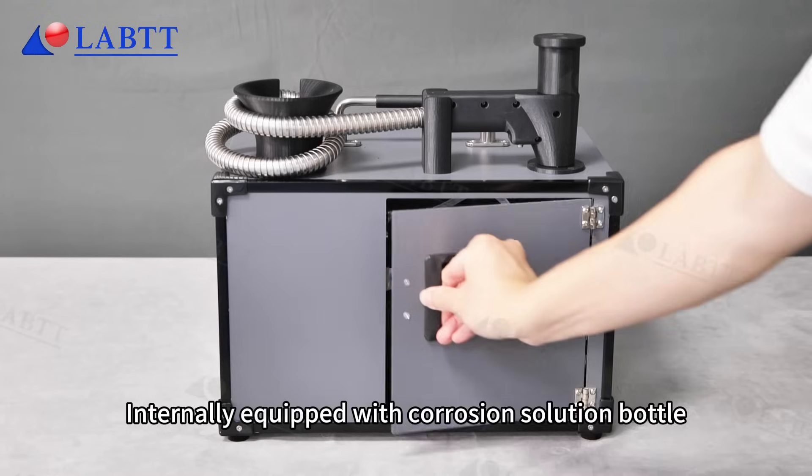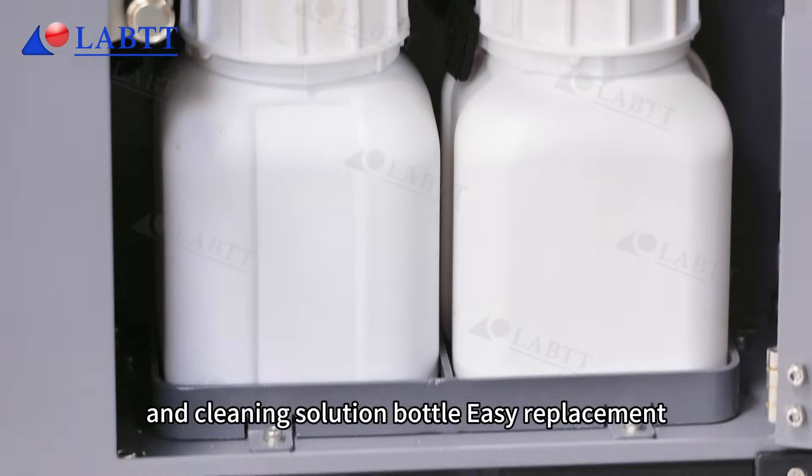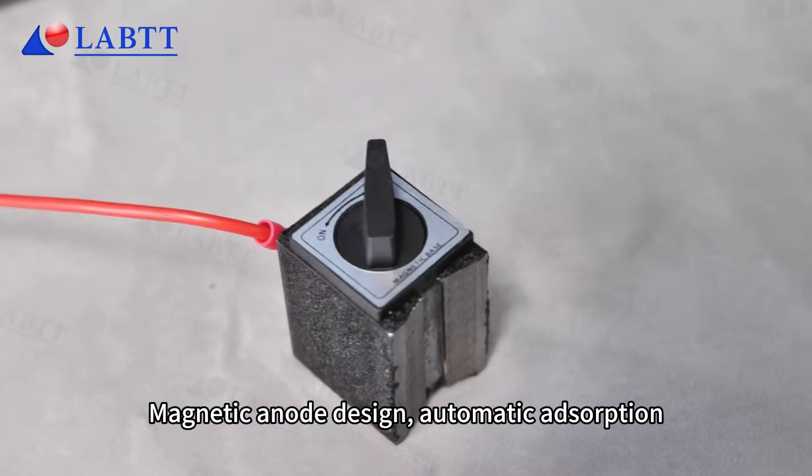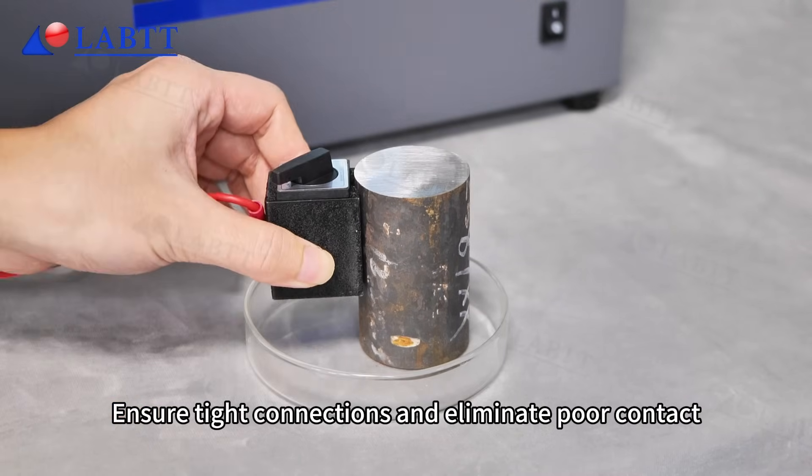Internally equipped with corrosion solution bottle and cleaning solution bottle. Easy replacement. Magnetic anode design with automatic adsorption ensures tight connections and eliminates poor contact.